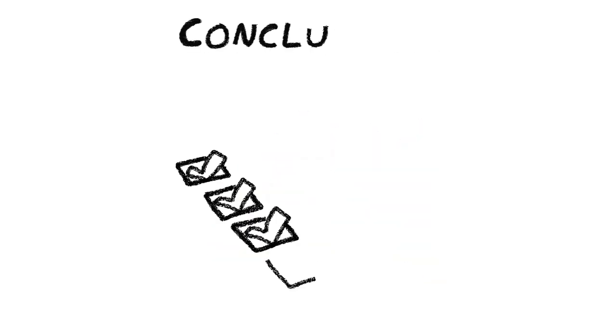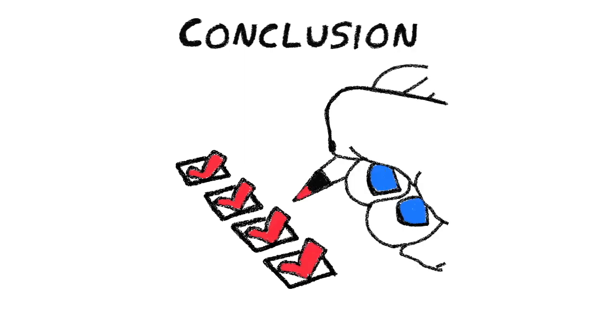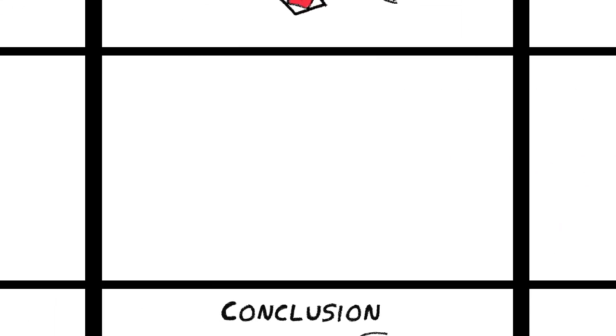To recap, we covered why TLC is used, the equipment and steps for a TLC experiment, factors that influence the results, and the limitations of TLC. That covers all the basics of TLC, and I hope you learned something new.